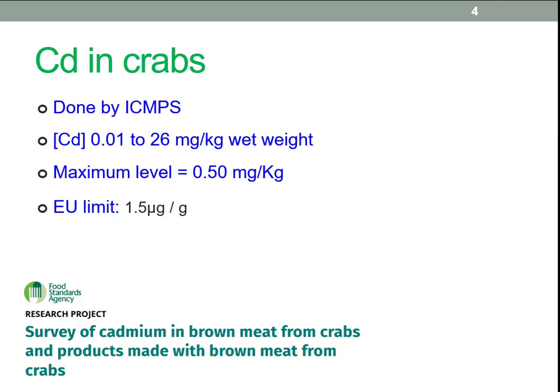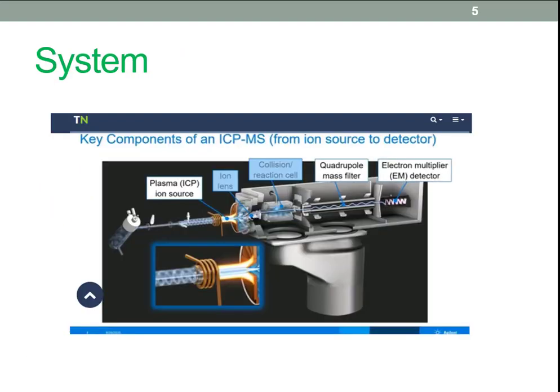Best way to analyse metals in food is ICPMS, inductively coupled plasma mass spectrometry, and we have such an instrument. These are quite an expensive piece of kit. Not many universities allow undergraduate students to use them. We'll have a more detailed look at the method later in the module. This is just a sort of introduction.